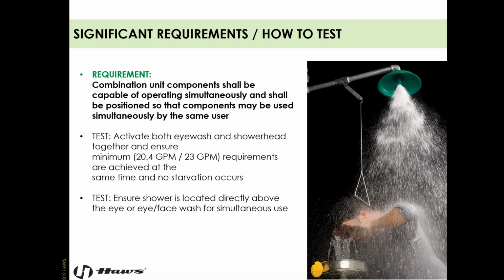I can't tell you how often I run into situations where the plumber, contractor, whoever installed the shower, put it on one side of the hallway and the eye wash on the other side of the hallway, thinking, oh, well, if you hurt your eyes, you can go this way. If you get something on your skin, you can go this way. But they're intended to be used at the same time by the same person.